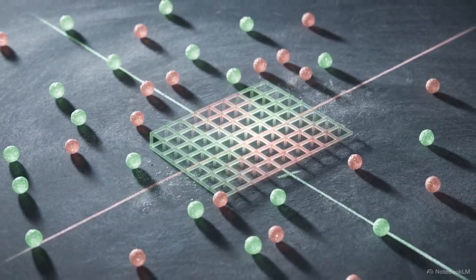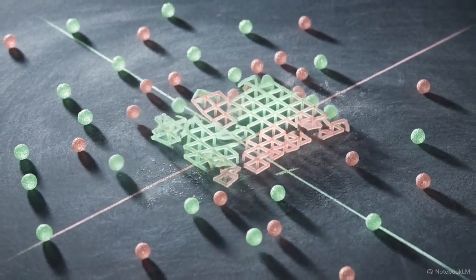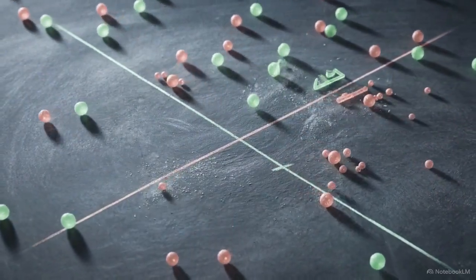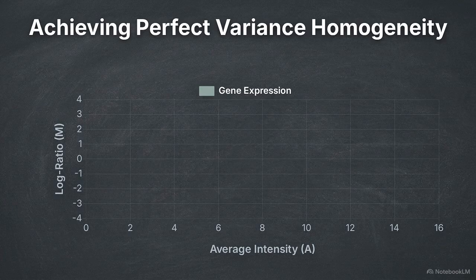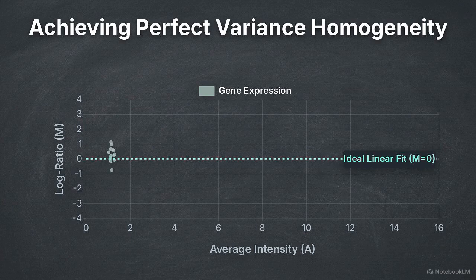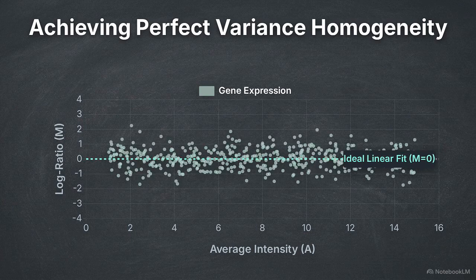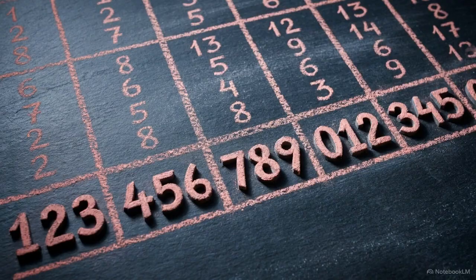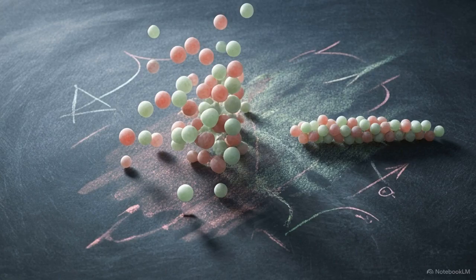When physical microarray images are quantified, the glowing fluorescent scan shatters into thousands of unlogged, highly variable digital data points. Limma uses empirical Bayes linear models to calculate differential expression across thousands of genes simultaneously. This modeling approach relies on a specific mathematical state, variance homogeneity. Raw two-color microarray reads fail this requirement. They are inherently biased and exhibit high variability, particularly when expression intensities are low.